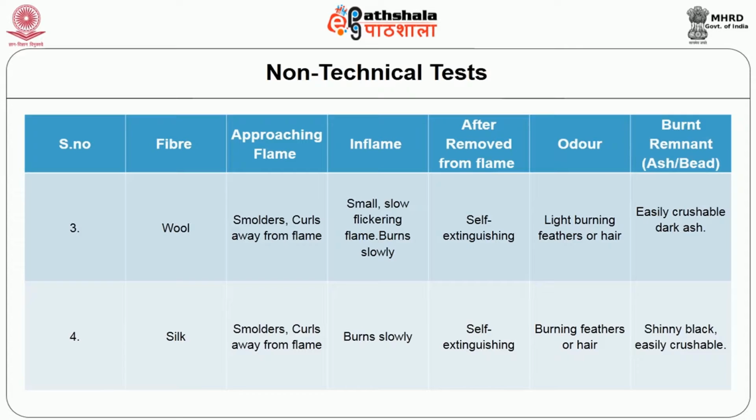Regarding silk, under the same category, it smolders and curls away from the flame while approaching the flame. In flame, it burns slowly. While removing from the flame, it self-extinguishes. Regarding odor, burning feathers or like burning hair. Regarding ash, it is shiny black and easily crushable.